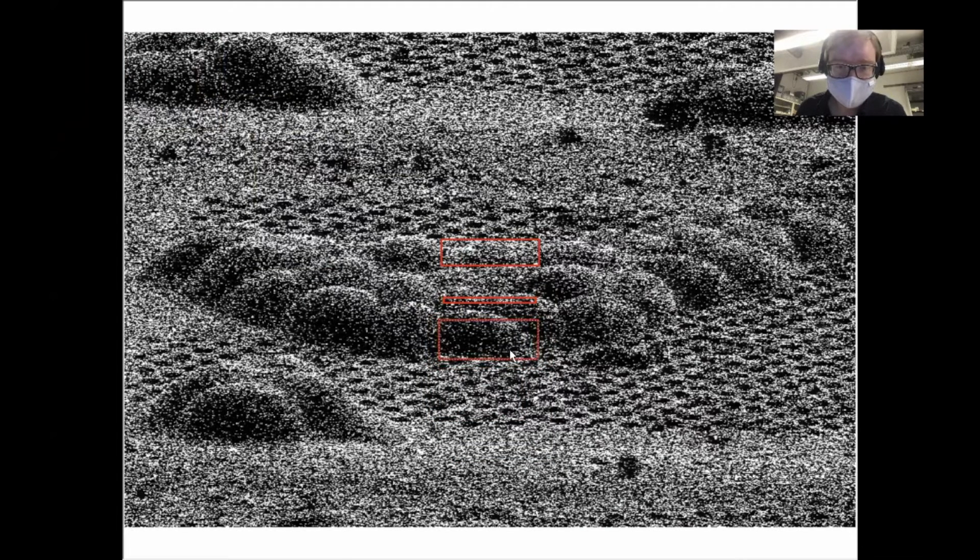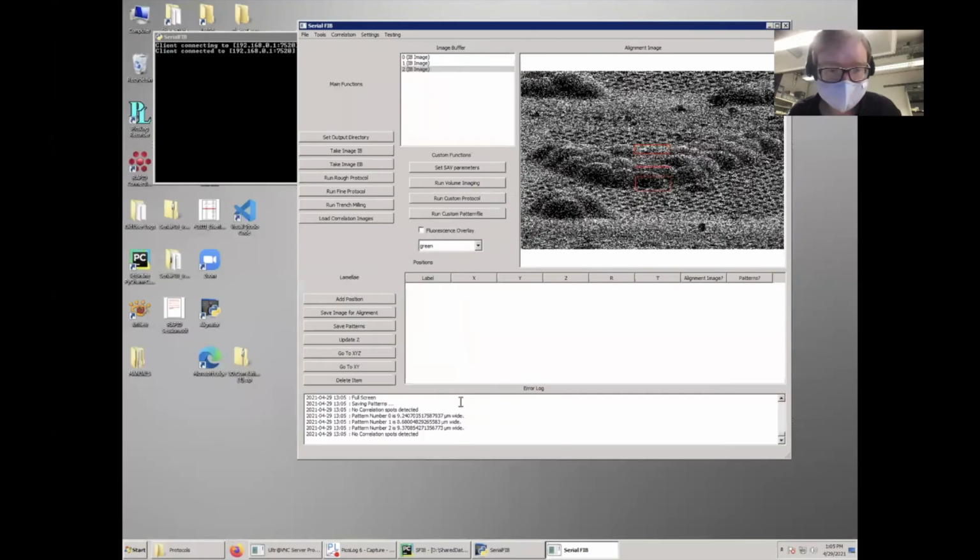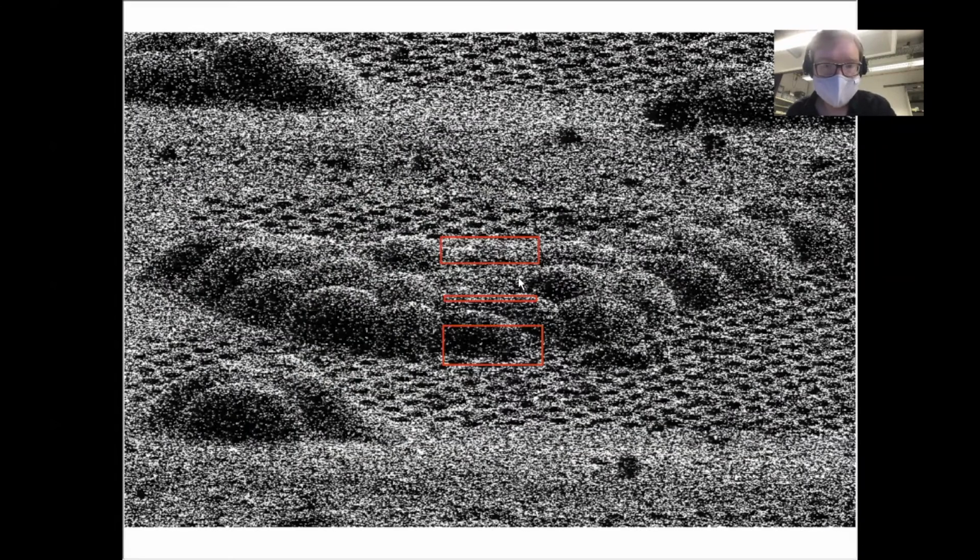And again, there's going to be a figure in the slides, but basically the width is given by the central pattern. If you wanted to know how large that actually is, you press F5 to go back out of the full screen mode, and you're going to have the width of these patterns from top to bottom. Pattern 1 right now would be roughly 8.7 microns. So that's going to be the width of this central pattern.